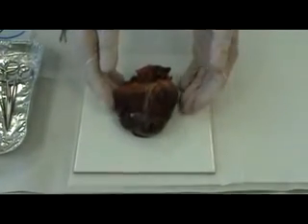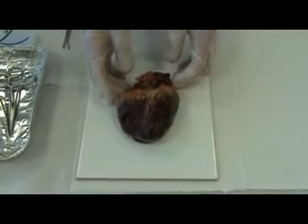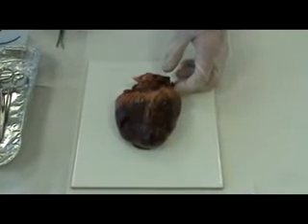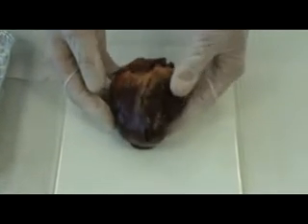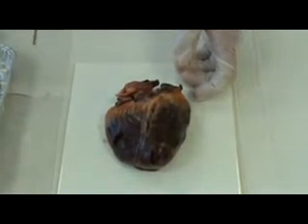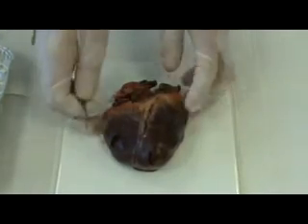And again, it's a very important organ, an organ that pumps blood around the body, carrying oxygen and waste gas, carbon dioxide. If we lift it up, it obviously weighs less than the ox heart, about 0.3 of a kilogram, thereabouts. It's got its fat on its outer surface. The fat is there, and some of it travels down the length of the blood vessels.